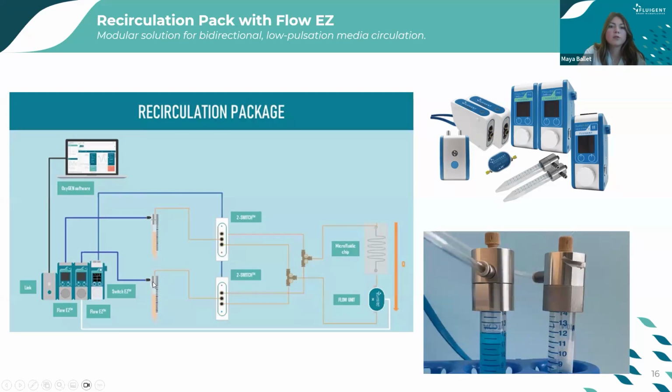After a defined volume has been transferred, the system can be programmed to automatically switch. Pressure is then applied to the second reservoir, and the valve switches position, so the liquid goes from the second reservoir to fill the first reservoir again. You can automate it to run for weeks, days, however long you want. And what's very important is that inside the chip, the flow remains unidirectional.